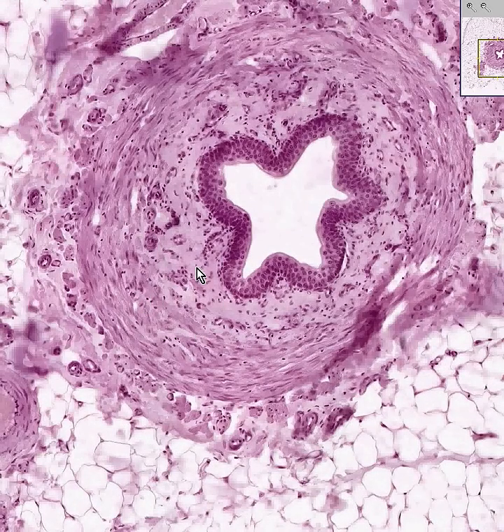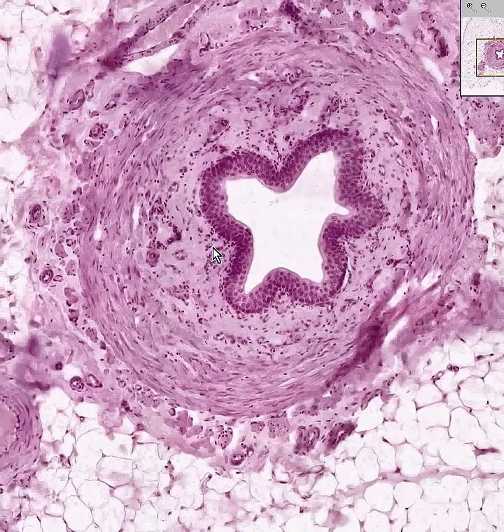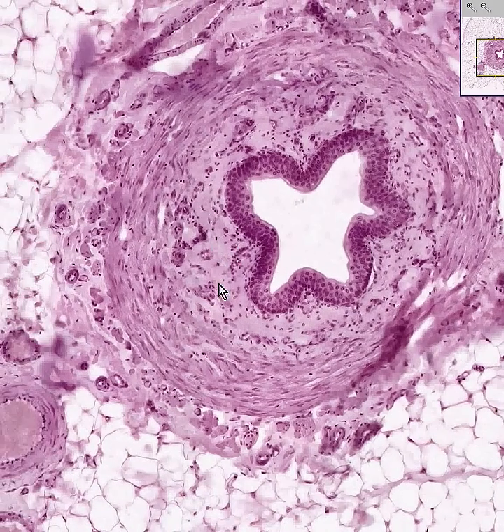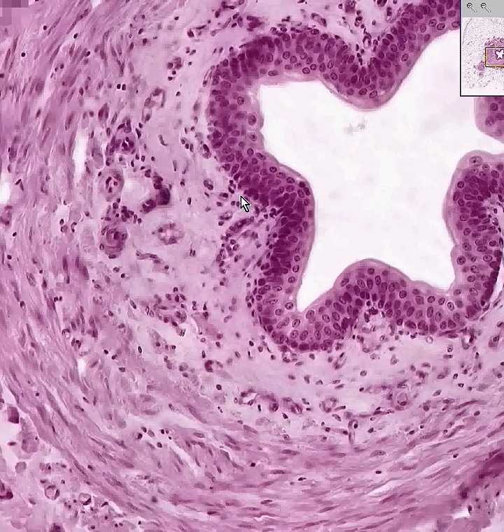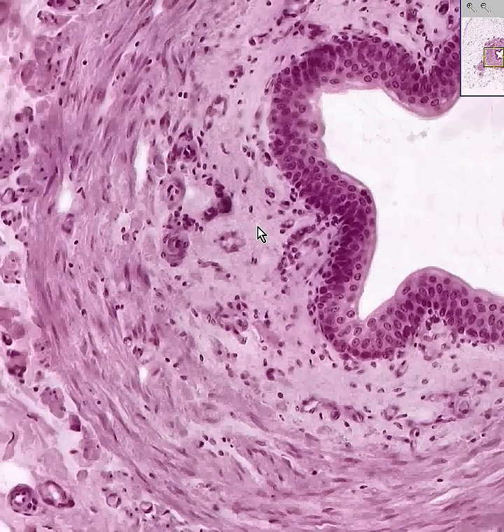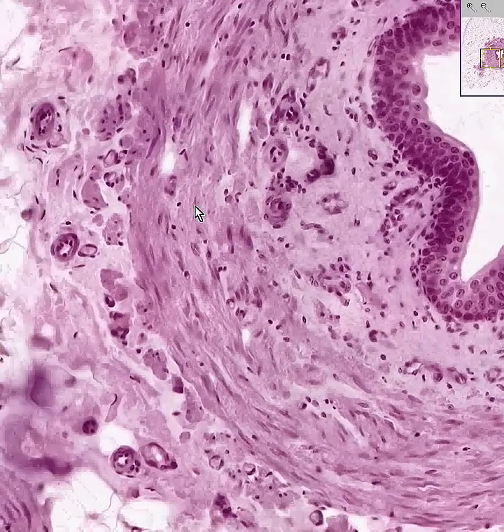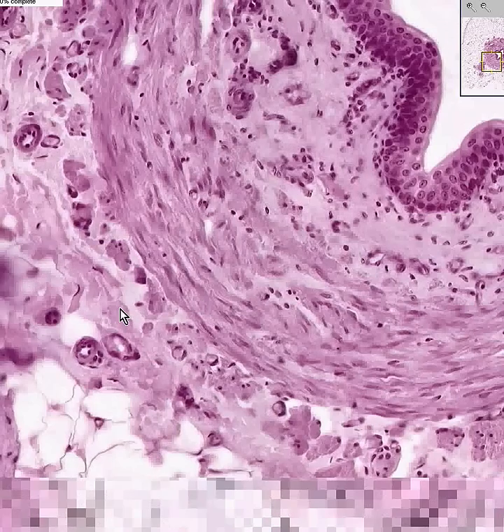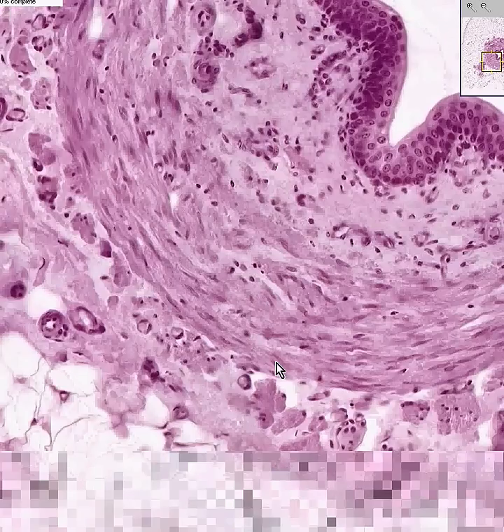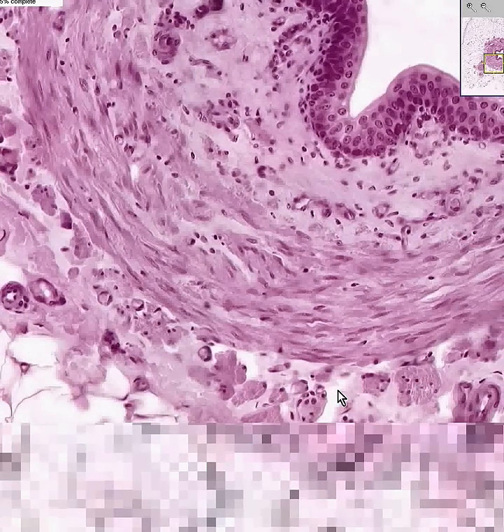What more can we really say about it? You have four or five layers of transitional cells. You have some blood vessels and collagen and looser connective tissue in the area directly underneath the epithelium. If you want to call this a submucosa, you may. You then have some circularly arranged smooth muscle bundles. You then may find some little nerves and blood vessels surrounding here. This looks like it could be a nerve.